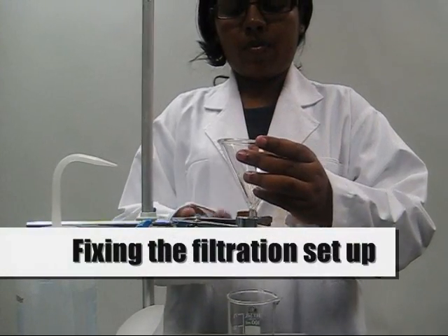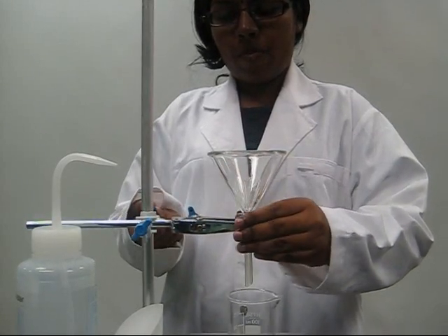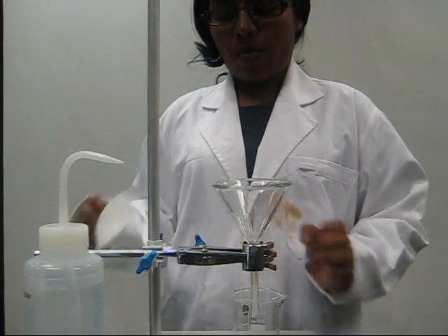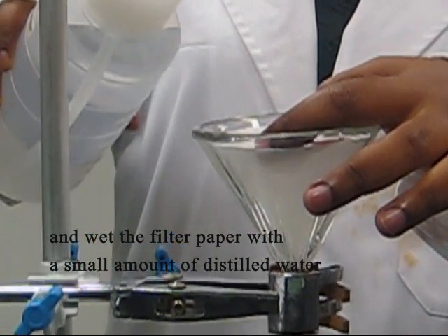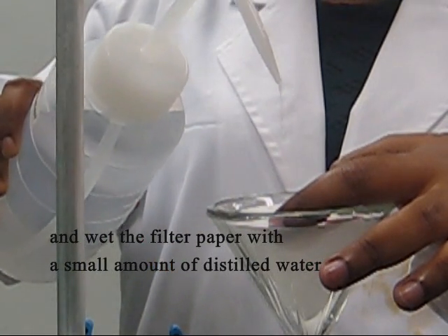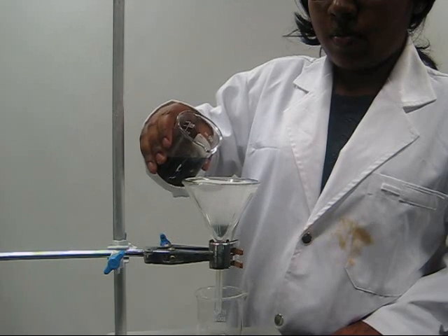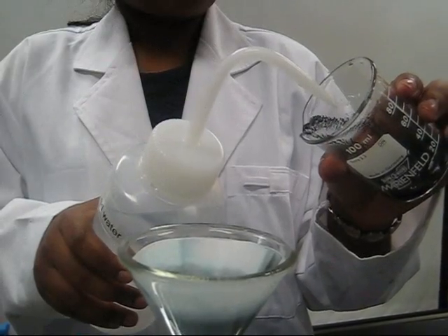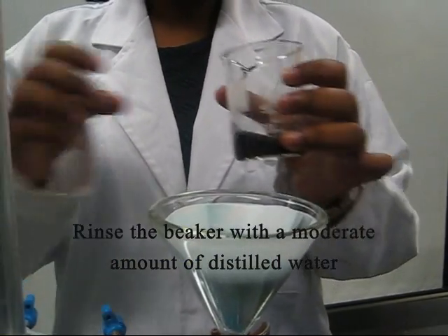Fixing the filtration setup: tighten the screw on the retort stand to keep the funnel in place. Place the folded filter paper into the funnel and wet it with a small amount of distilled water. Pour the solution into the funnel a little at a time to prevent clogging of the residue in the cone. Rinse the beaker with a moderate amount of distilled water to ensure that no solution is left in the beaker.